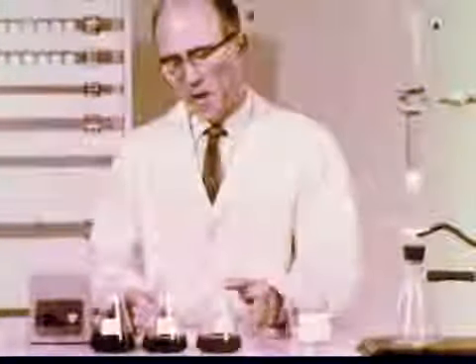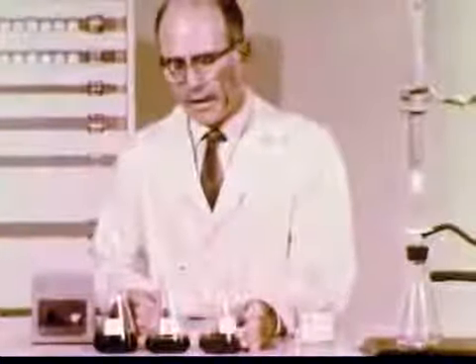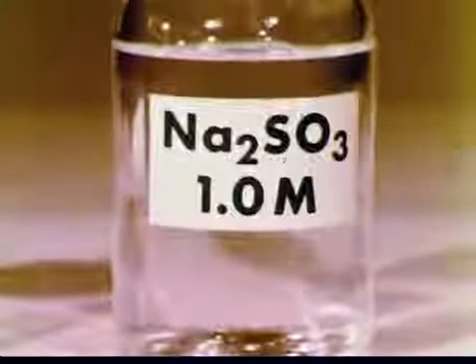So far, we have only concerned ourselves with the chemistry of vanadium in the presence of water molecules and the hydroxide ion. Now let's study the chemistry of some of the vanadium ions in the presence of other negatively charged ions, such as thiocyanate and sulfite.